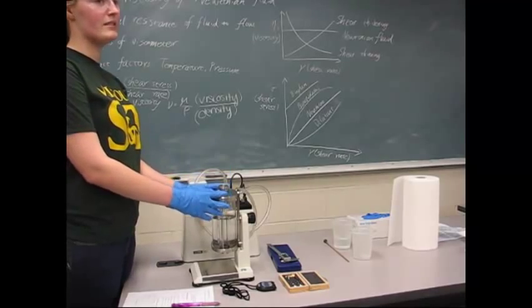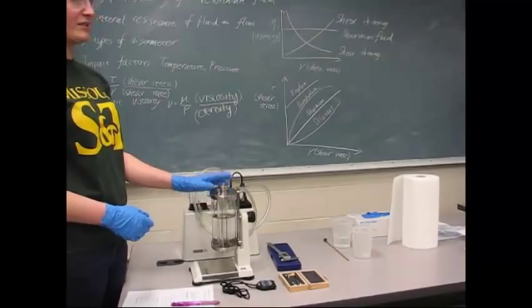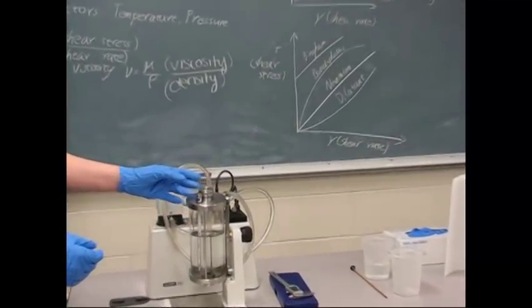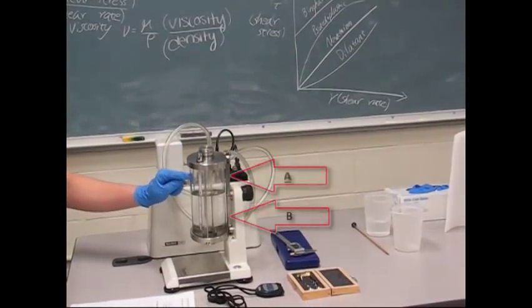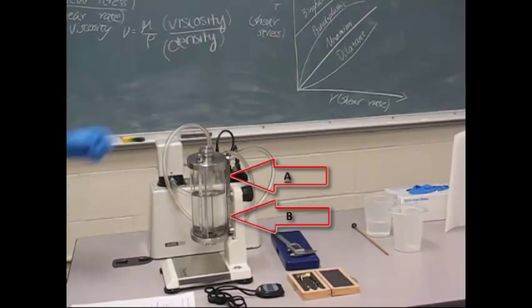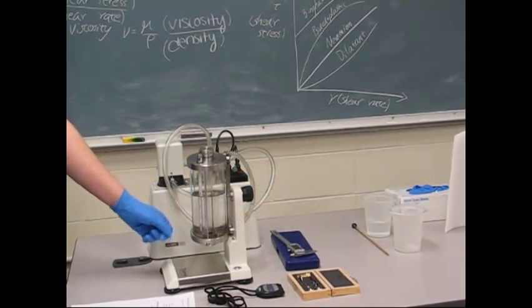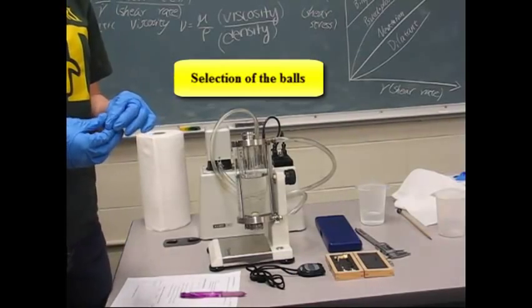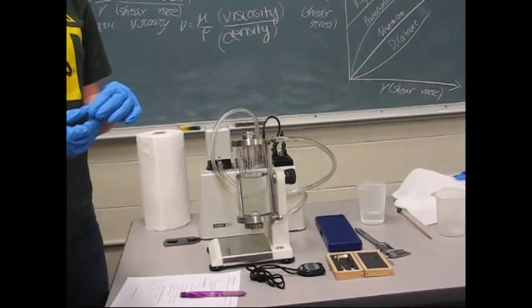So this is a falling ball viscometer, and it measures the viscosity of transparent Newtonian fluids like water. It does so by using the marks A on the top and B on the bottom and measures the distance that the ball falls and the time between those two. Since water has a viscosity of around one centipoise, we want to make sure we choose the correct ball to run this experiment with.